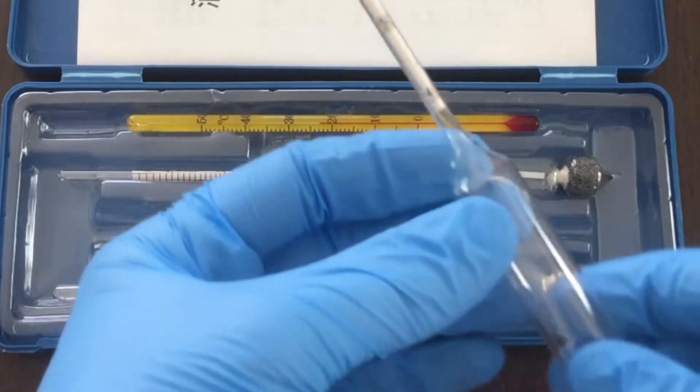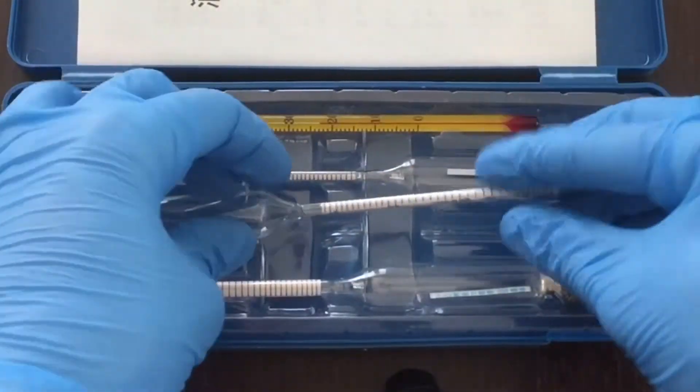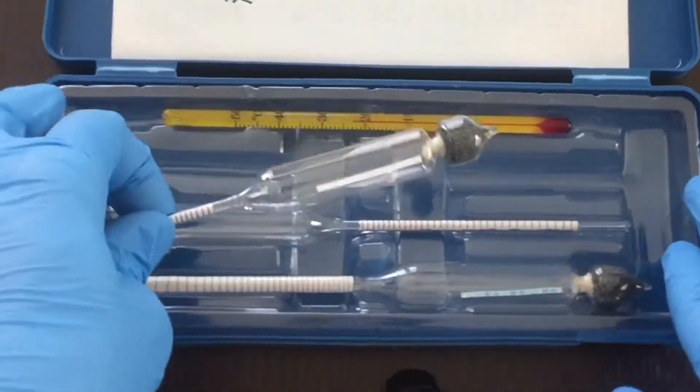It comes in a blue thin hard plastic case with three hydrometers and each of the hydrometers are rated for a range of concentrations.